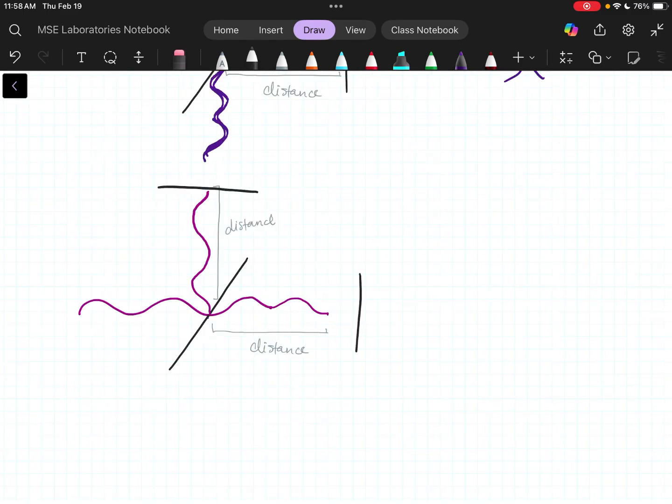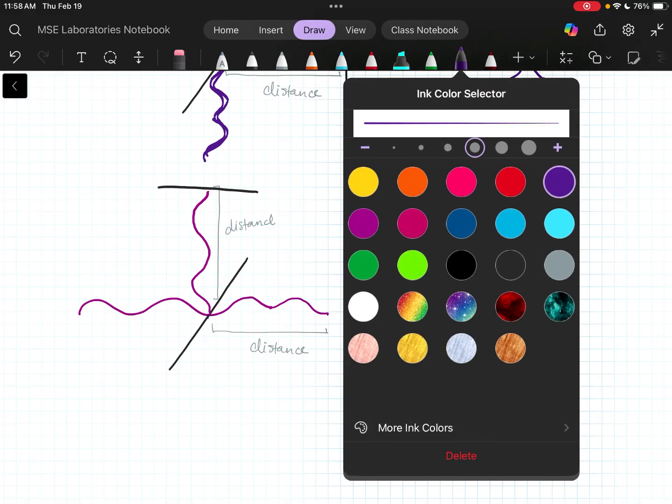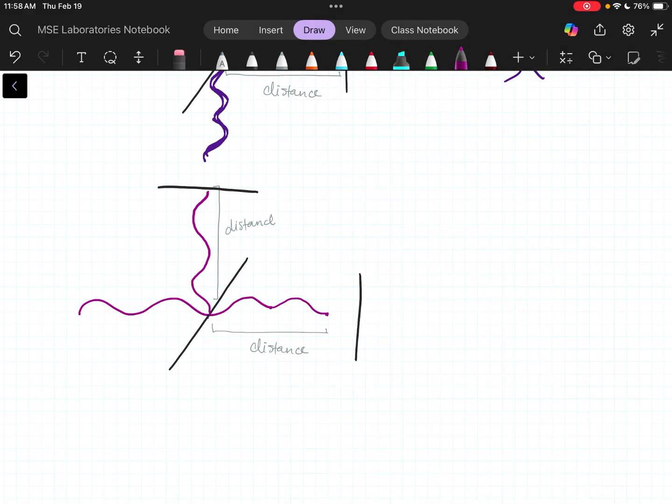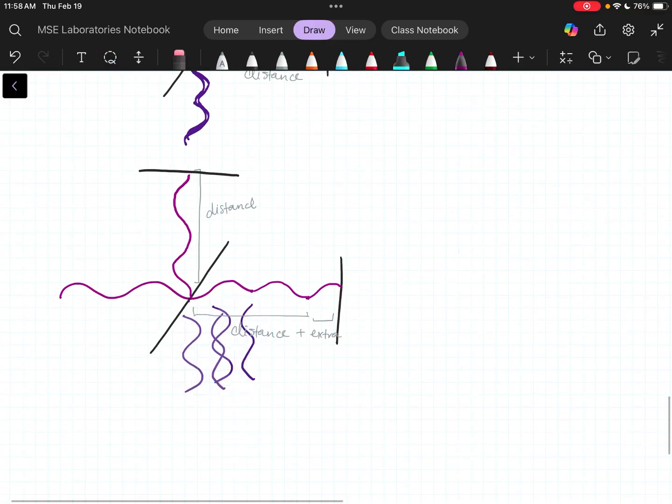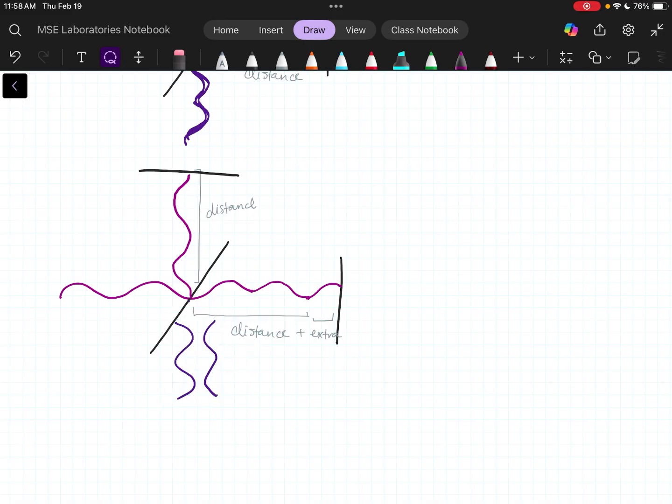Let's say instead my mirror is a little farther. That means that this wavelength completes a little bit more. And when they come back together, I'll actually just pull up what I drew already. They may come back and look something a little bit more like this.